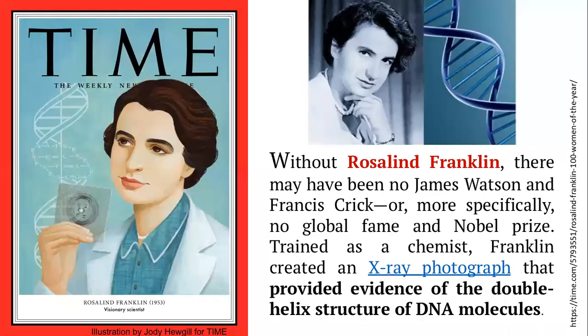And all this came into play because of the findings by William Röntgen, the discoverer of the X-ray. And how exactly this X-ray diffraction pattern has revolutionized the way we look at biological science today is because X-ray diffraction analysis helps us understand the life molecules like the proteins and the nucleic acids.